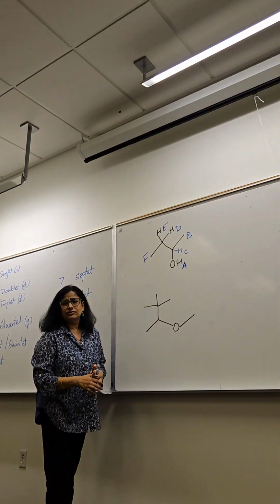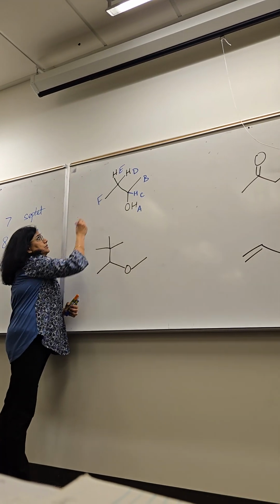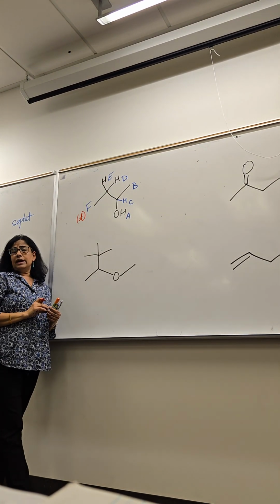I'll start with F. What do you expect the splitting to be? Do we all agree? Yes. Because of the neighboring hydrogens, there are two of them. Everybody okay?